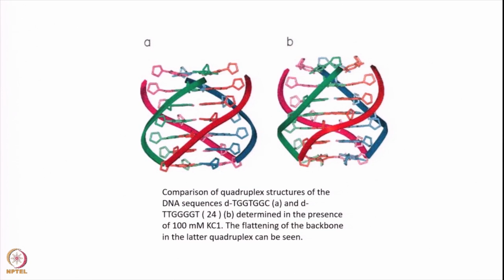We have talked about the quadruplexes, and there can also be triplexes. We talked about the triplexes earlier in the previous lecture when we talked about the structures, and there are also characteristic NOEs for the triplex structures as well, depending upon the base pairing scheme, whether it is TAT or AAT triples, you will have different kinds of NOEs. So with that we will be able to calculate these triplex structures as well. Therefore this establishes the enormity of the DNA structures, which certainly enables the packing of the DNA inside the nucleus. So I think we can stop there, and that completes the nucleic acid structure calculations and the varieties of nucleic acid structures.